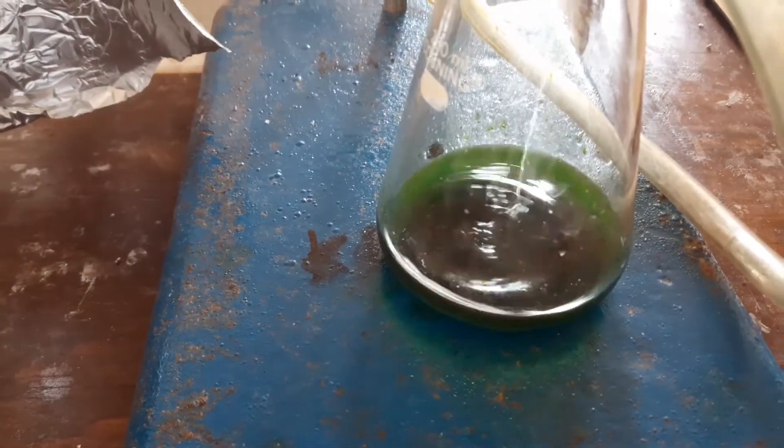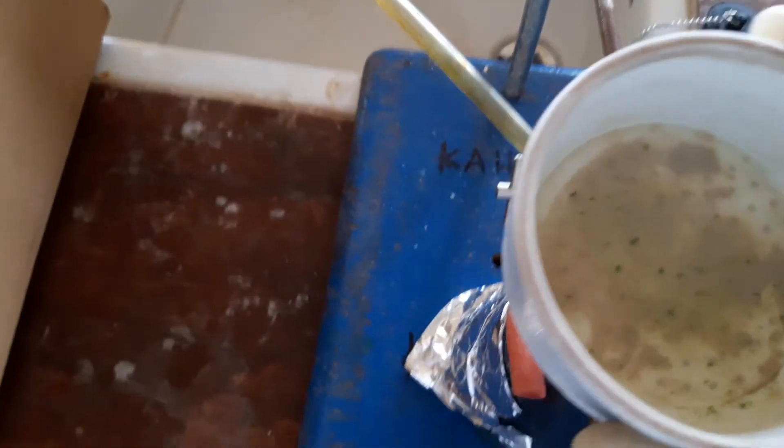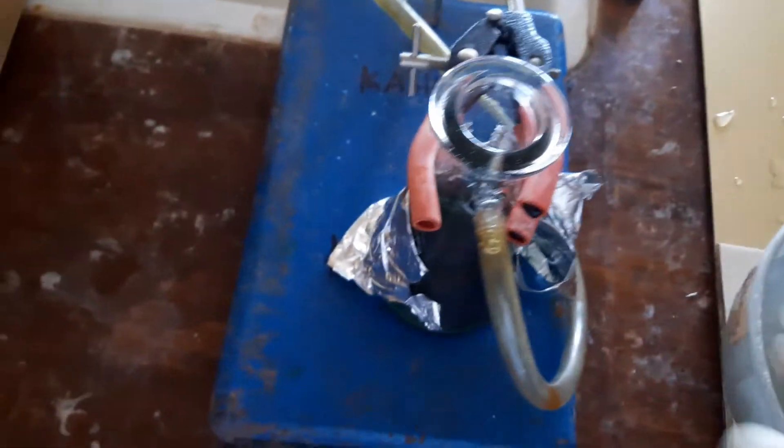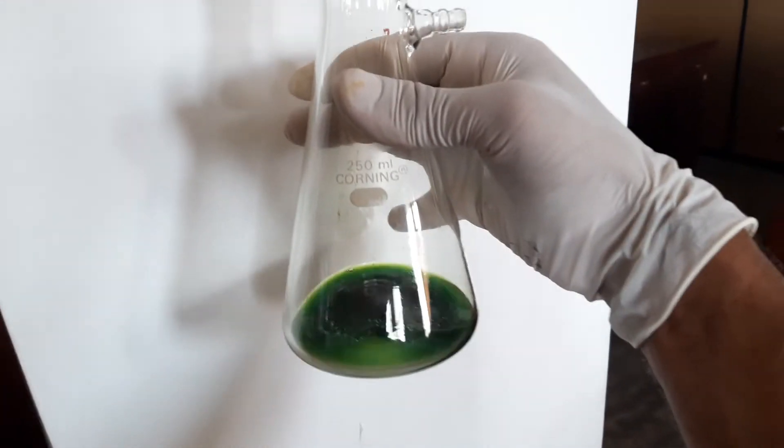After finishing the filtration, you can see the extract in the flask — the solvent fraction is now filtering through. It's a very dark green color. After filtration is finished, we detach the Buchner funnel and release the vacuum. This is your carotenoid solution. Our extraction step is now finished.